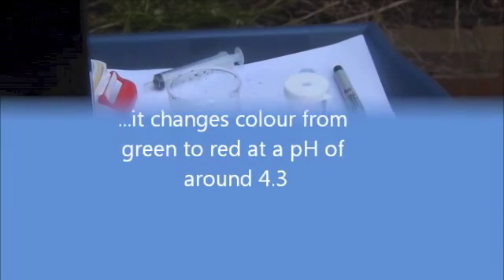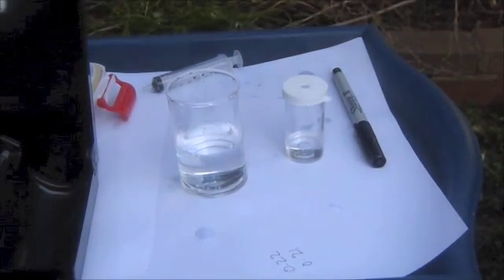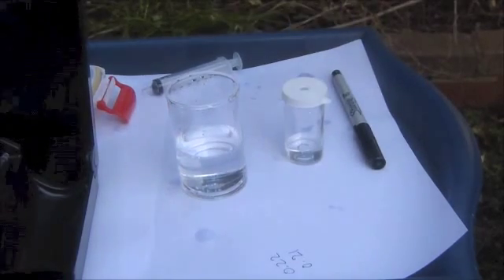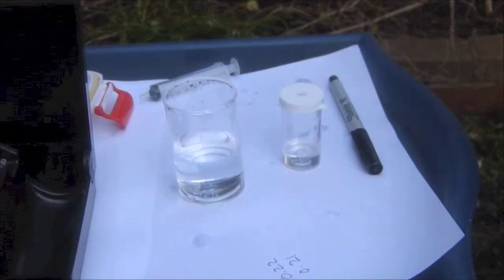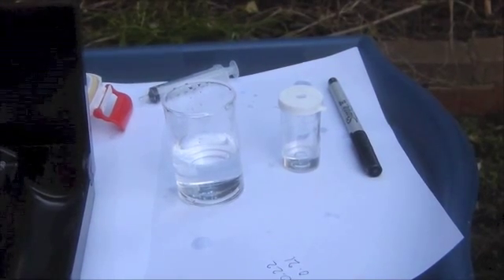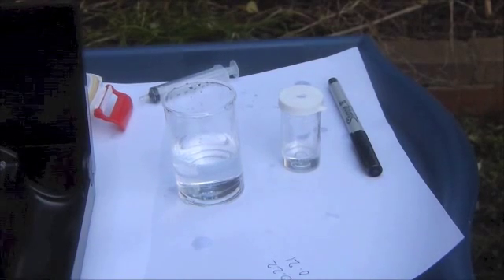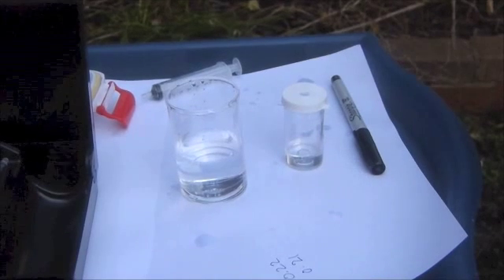So I've just shown you how to use the HANA Instruments kit, and you've seen that they provide you with an indicator which changes from blue to yellow. If you use the AquaMerc kit, they use, I think it's a methyl orange or methyl red based indicator which changes from greeny blue to red. So you just have to be aware of which indicator you're using.